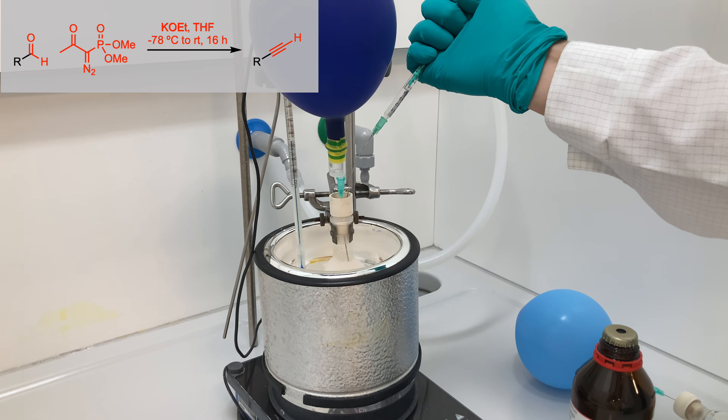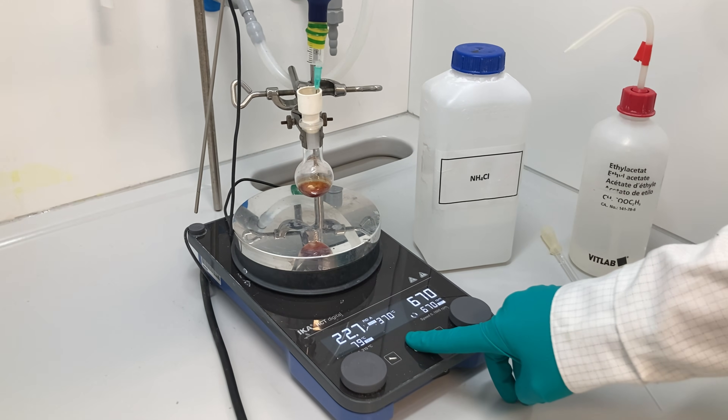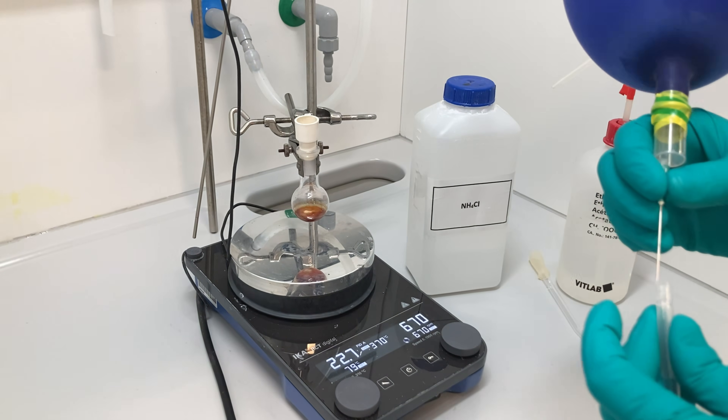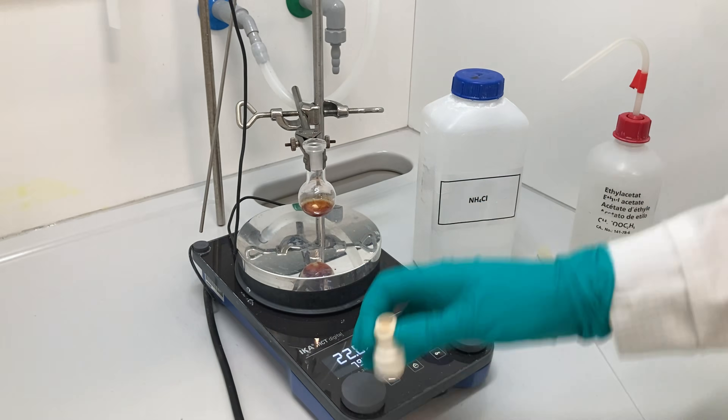Once the addition was complete, I allowed the resulting mixture to stir overnight at room temperature. The following day, I removed the argon balloon and the stopper to quench the reaction with a saturated aqueous solution of ammonium chloride.